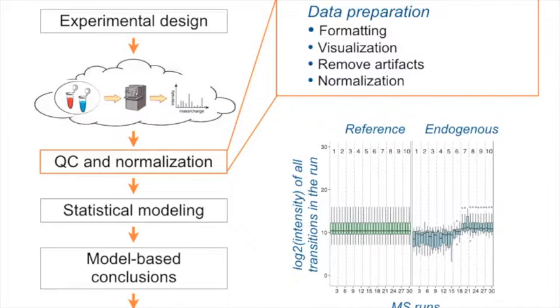And so what we just said is that with an endogenous protein, you never know if it's not affected by a stress. However, you may come up in your specific biological system. You know about your stresses so much that you can safely say that this protein will not be affected. But then you can use it as an internal standard. But it's not a very general strategy. So again, unfortunately, there's no single recipe to do it well all the time.